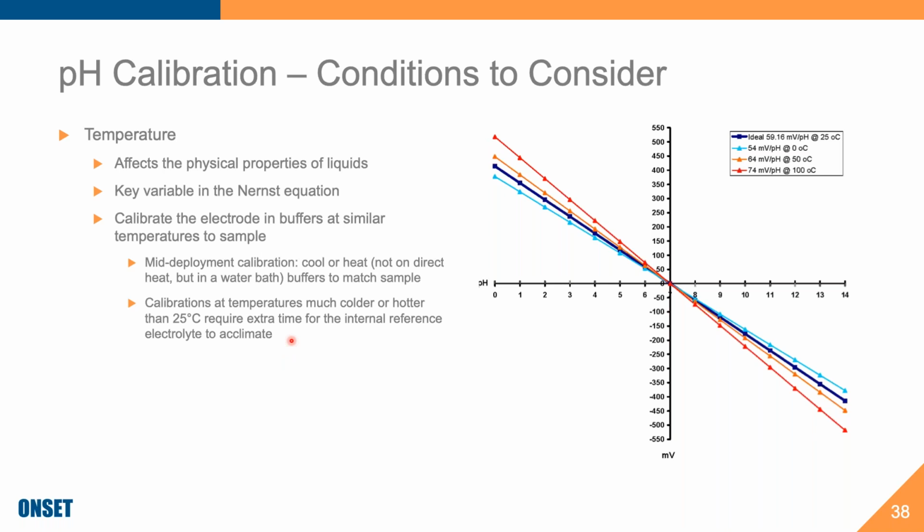Just make sure that you're remembering that your pH electrode that was sitting in your car, for instance, on a hot day in Florida, is likely going to have an internal temperature of that electrolyte that's somewhere in, let's say peak summer, the 90s even, but your water's like 70 degrees. So you'll want to make sure that you give your electrode time to equilibrate to the sample, or that you're also calibrating to the sample's temperature and also letting the electrode equilibrate to the buffer.